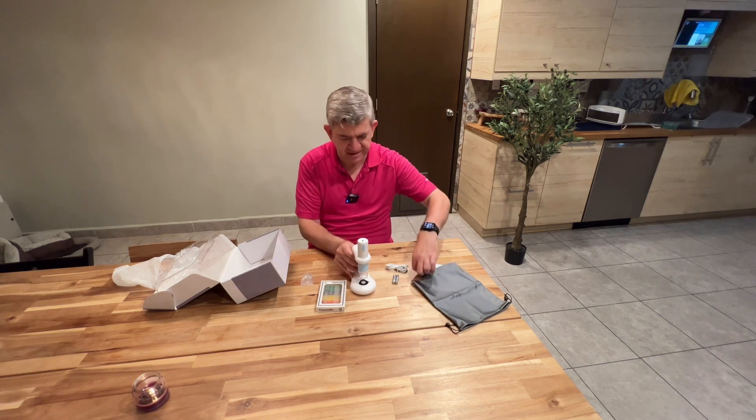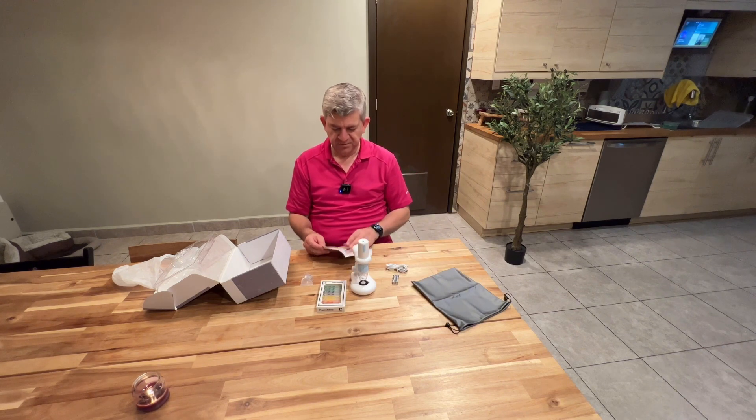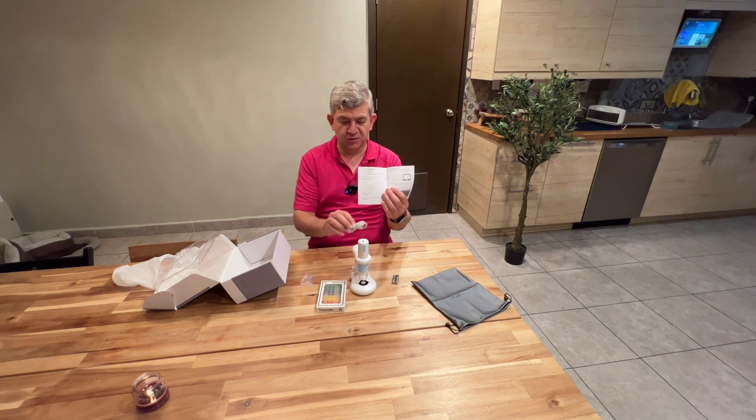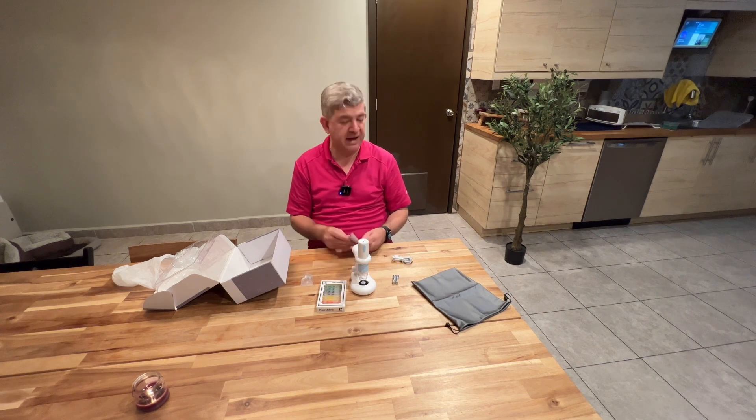Everything will be transferred to your phone or to your computer. You have to connect it to your computer so you see everything from your app. Let's try it.